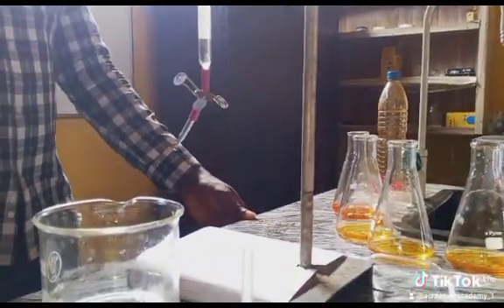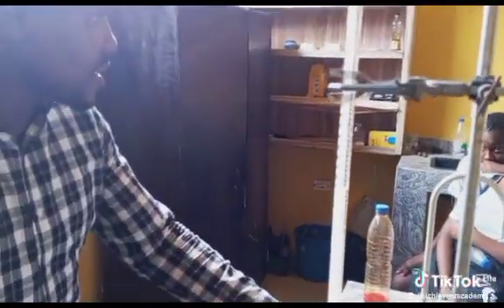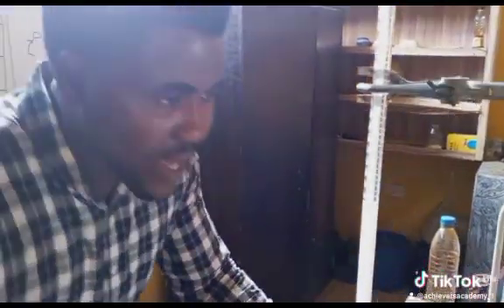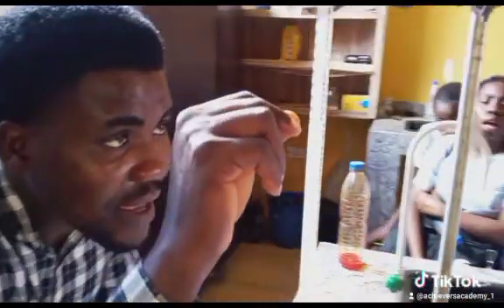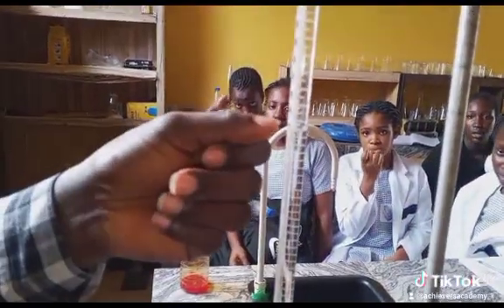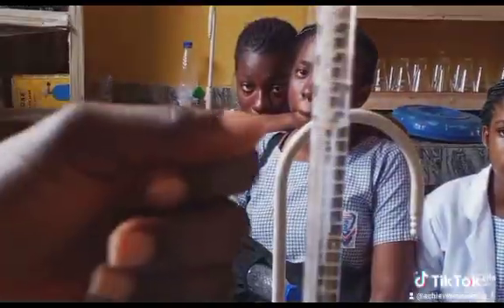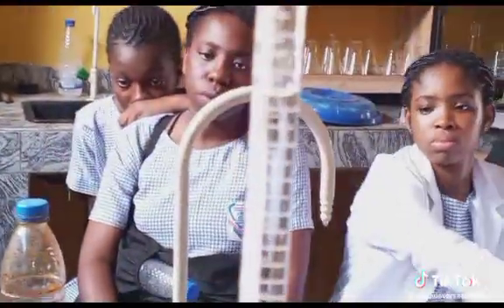Please bring the camera closer to this now. We are going to take the value here. What volume of acid neutralized this 25 centimeter cube of the base? I'm having 27.6 exactly. I've taught you how to read off this value. So this is 27 point. Each mark there is 0.1. So if this is 27, I need a pen.